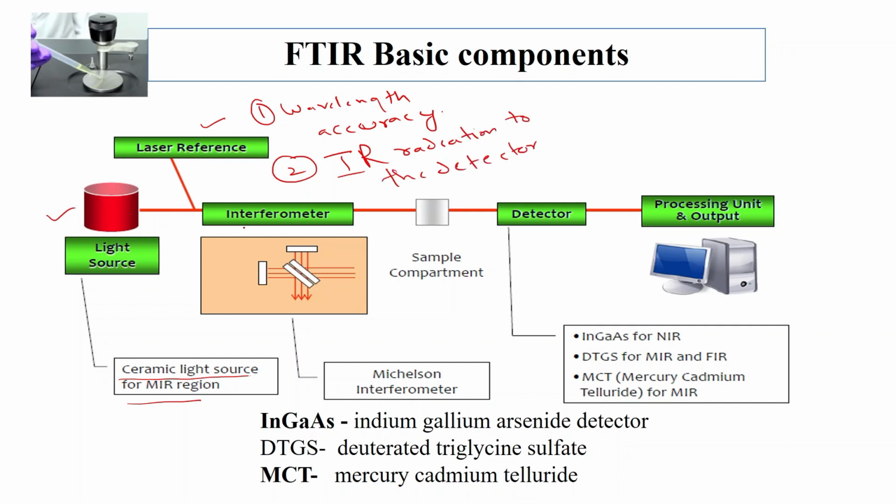Then we have the interferometer working, which we will discuss in the coming slide, and mostly the Michelson interferometer is used. Then we have the sample compartment, and then we have the detector.